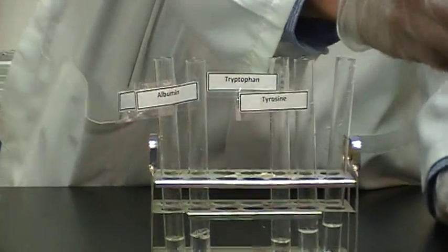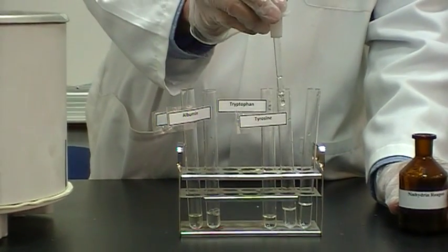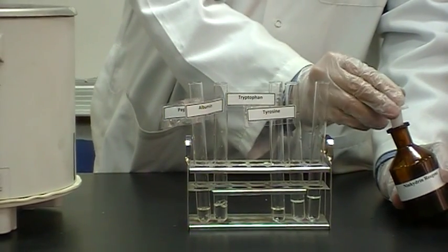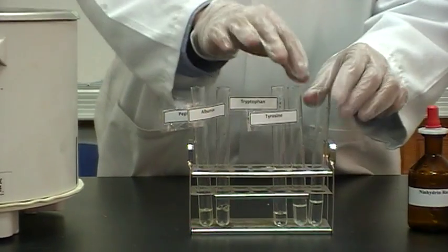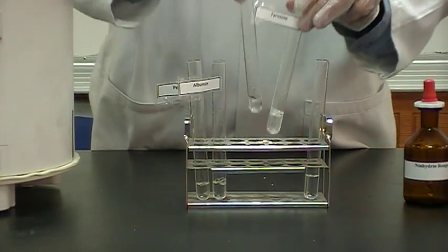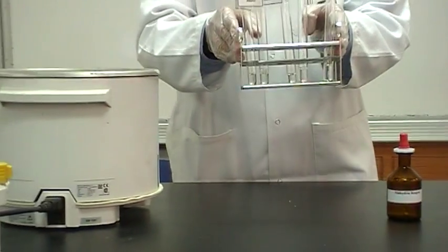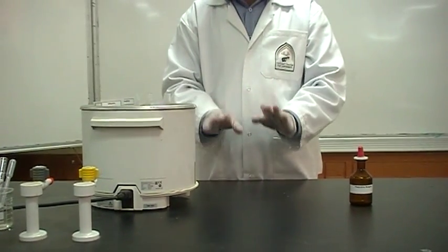So let's add around two or three drops of the ninhydrin to each tube. And don't forget, we need to shake very well. And then we transfer to the water bath and we have to wait for two or three minutes.